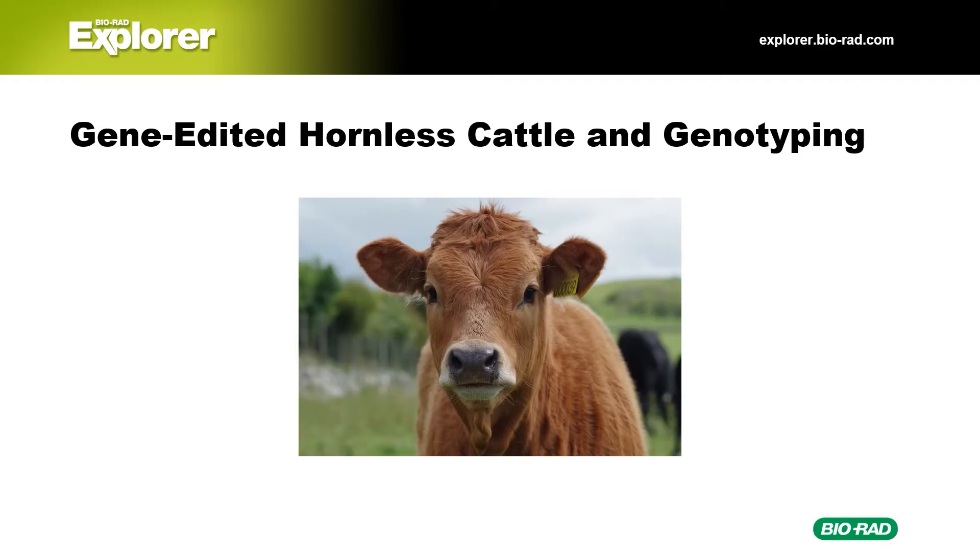Normally, the horns of dairy calves are removed. Scientists at a startup company called Recombinetics used gene editing to swap out just a few nucleotides, so the dairy calves never grew those pesky horns. But when the FDA took a closer look at the genome of the cows, they discovered some remnants of the cloning vector, including bacterial genes for antibiotic resistance. The company had claimed that the animals were 100% bovine, but they had neglected to verify their work by genotyping. Because the gene-edited calves had traces of bacterial DNA, they were now considered genetically modified organisms, or GMOs, and thus subject to FDA regulation. This story really drives home the importance of genotype verification to ensure your target DNA was edited in the way you intended and that there weren't any off-target sites.